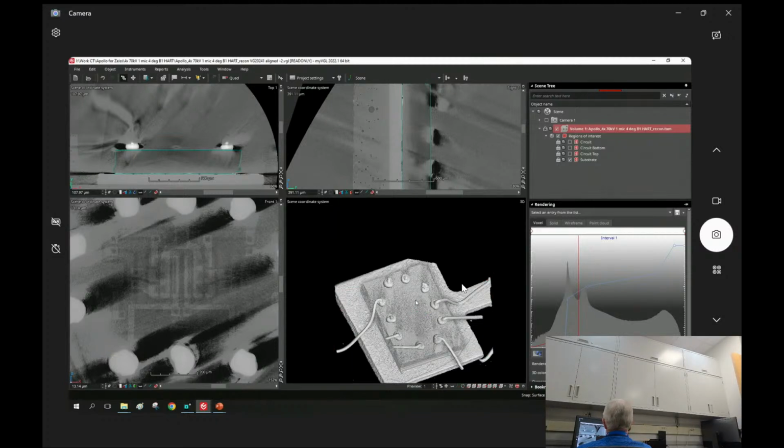In this case, I was using something called quake gel, which is a polysiloxane that's used typically for figurines or museum specimens that in an earthquake zone, you don't want them dancing across the top of a shelf and falling off the edge. So very low extractables, and it flows. If I put something like this in around it, air will displace over the course of about a day, and I have very, very good contact between the quake gel and my surface.